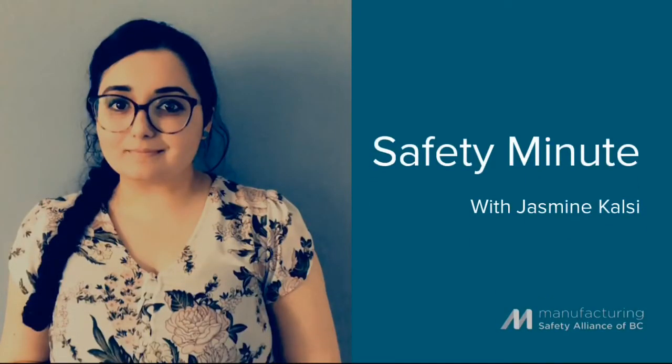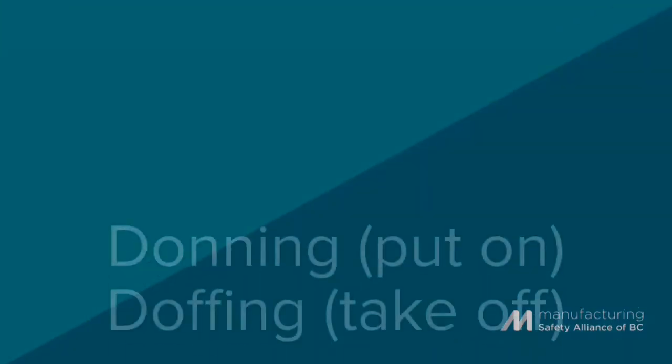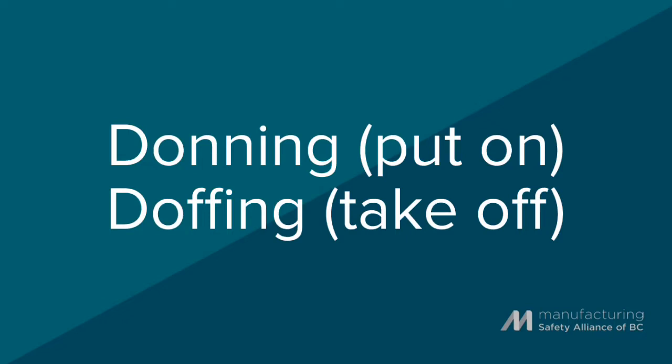Hi, my name is Jasmine Tulsi. I'm the Occupational Hygienist at the Manufacturing Safety Alliance of BC. In this video, Safety Advisor Sherry Snow is going to demonstrate how to don and doff your reusable half-faced respirator.